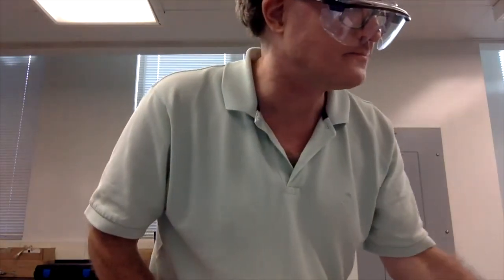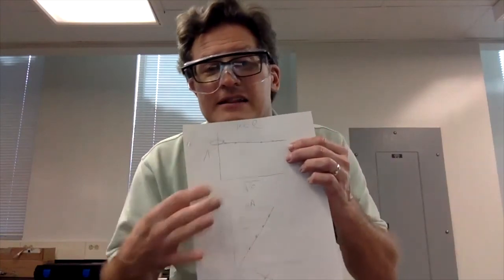All right? So that is our experiment for this week, right? Be careful about cleanliness. Know how you're making your experiment work in the lab when you take the data, and therefore what it's sensitive to for interferences, and think about how you analyze your data to analyze it in the best possible way.